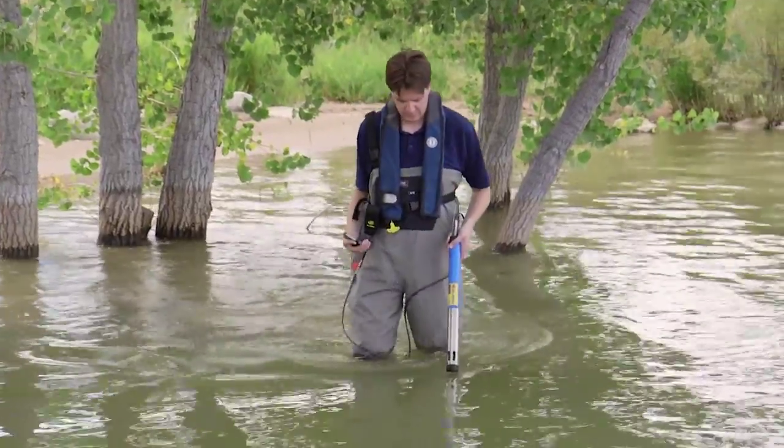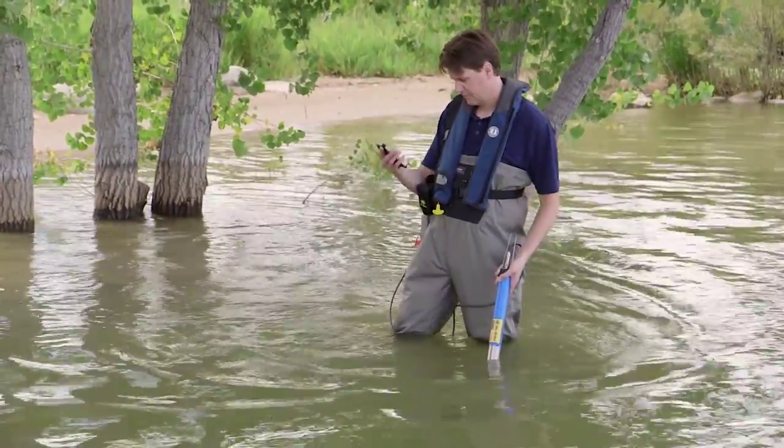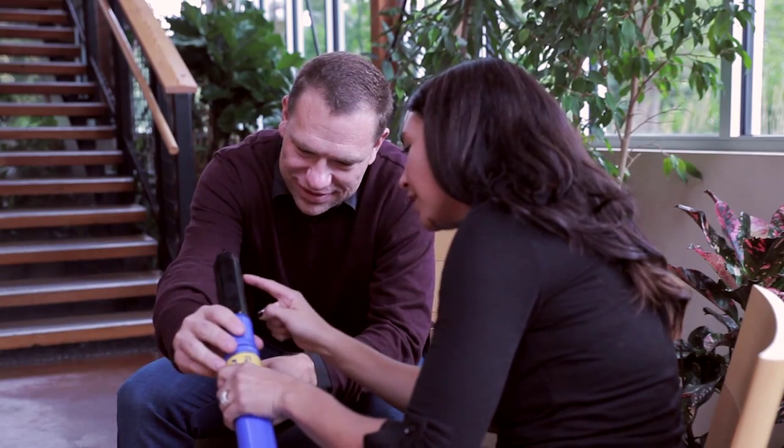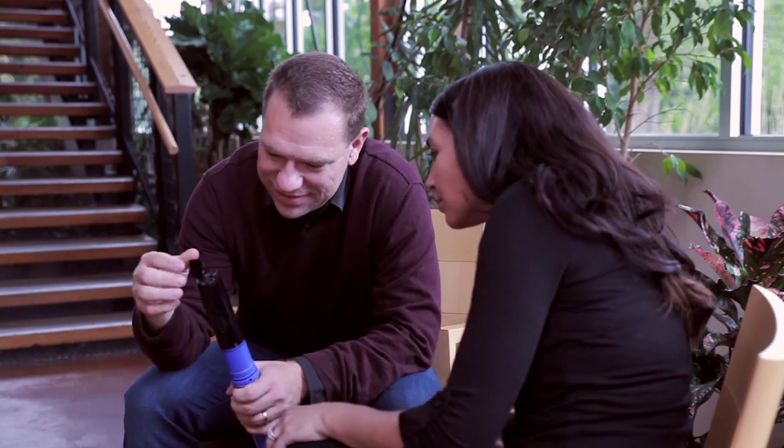At In-situ, we believe that environmental monitoring is about having quality information at your fingertips to make the right decisions. With the Aquatrol 600 multi-parameter sonde, we didn't set out just to build another water quality instrument. We challenged ourselves to make the most accurate, reliable, and easy-to-deploy instrument on the market. Because when the instrument just works, we can all stop spending our time on setup and maintenance and focus on the real environmental issues. I'm excited to introduce the Aquatrol 600 and share our passion with you.